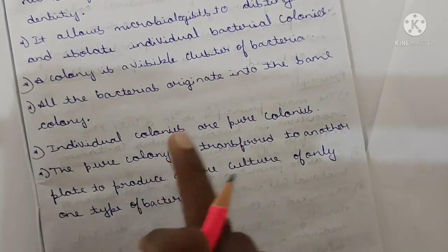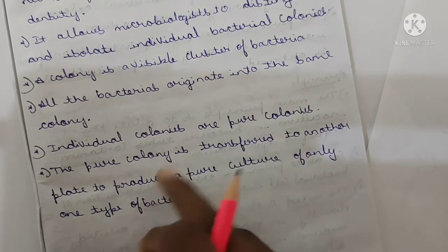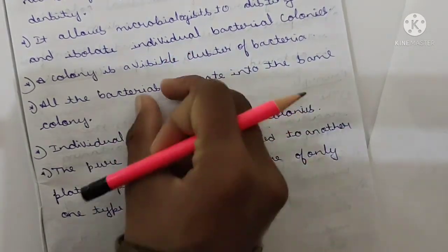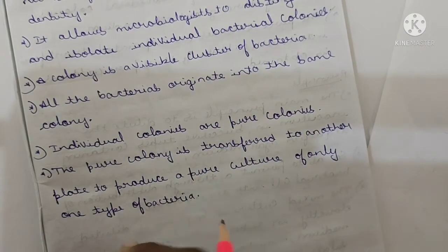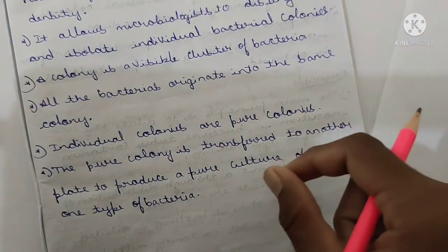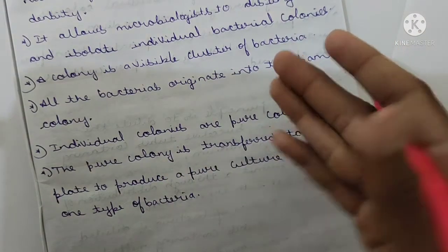The pure colony is transferred to another plate to produce a pure culture of only one type of bacteria. That pure colony, we are collecting and transferring to another plate to produce a pure culture.